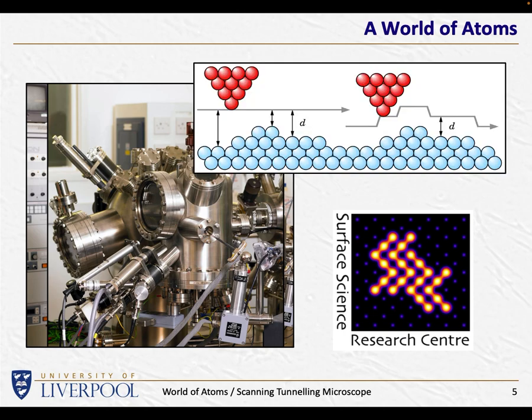And it works, the scanning tunneling microscope works on quantum mechanical principles. We don't have to worry about the details, but it works on the principle that a very sharp tip is brought close to a surface. So you can imagine a large surface made up of atoms and molecules. A sharp tip is brought down fairly close, but not actually touching the surface. And we apply a small voltage between the tip and the sample and see how much current flows. According to Isaac Newton, no current will flow until we actually close the circuit, or perhaps according to Faraday, no current will flow until we complete the circuit.